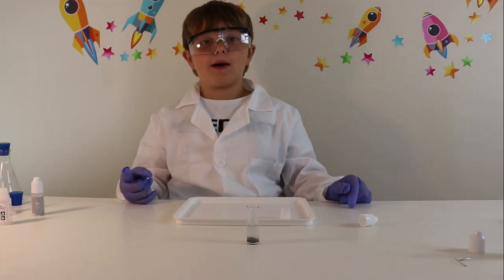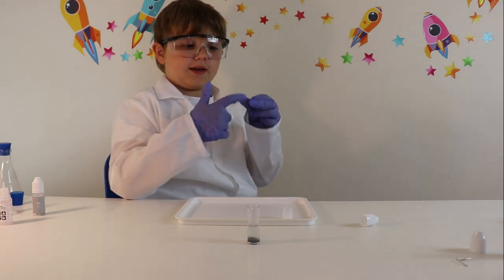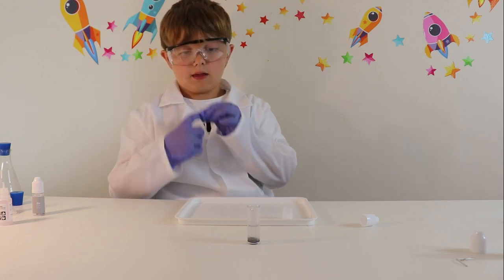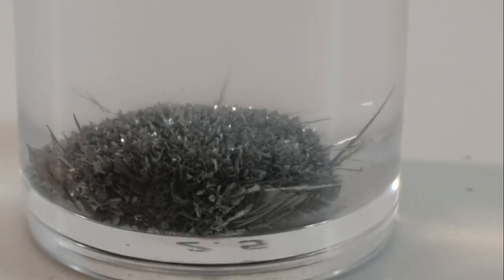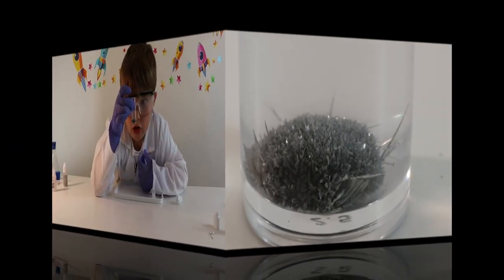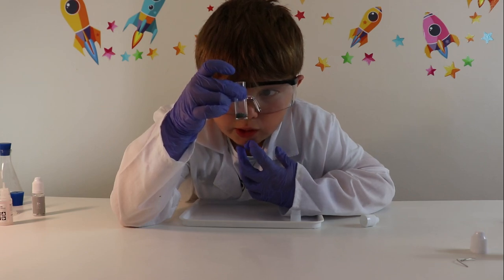So guys, after about 20 minutes we got this — didn't we Mummy? Yeah! So our experiment has finished and it worked. We created our own hedgehog in the vial, and it does look weird, doesn't it! This is weird — that is really cool!